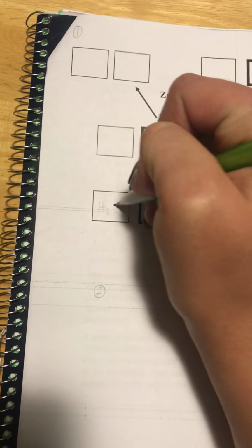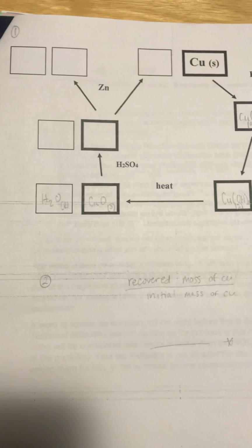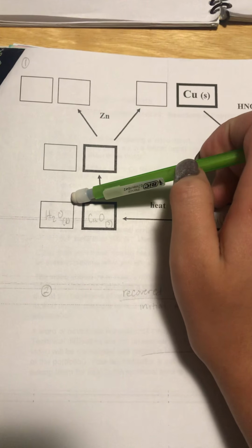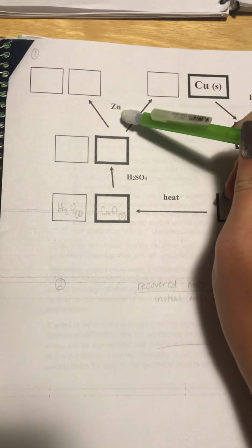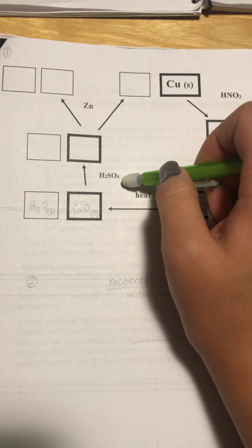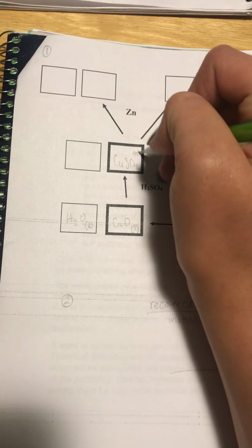And we will add some hot H2O as a liquid. And when we do this, we'll decant the solid from the liquid. And then after that, we will add the sulfuric acid, H2SO4, seen here. And when this is done, in reference to table 2.1, we create our copper sulfate, which is CuSO4, an aqueous solution.